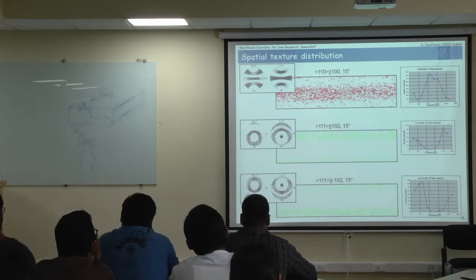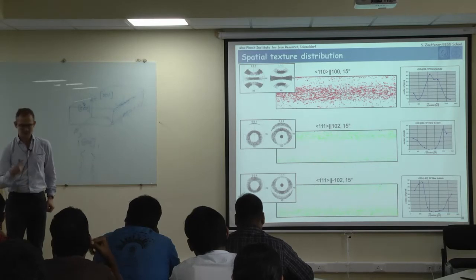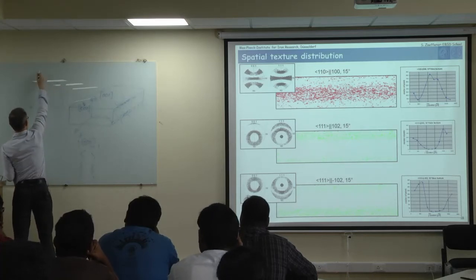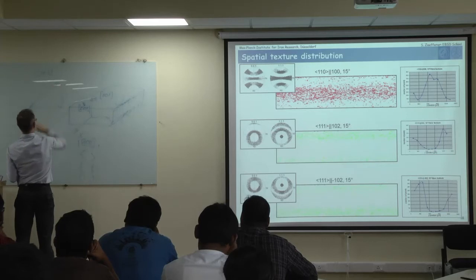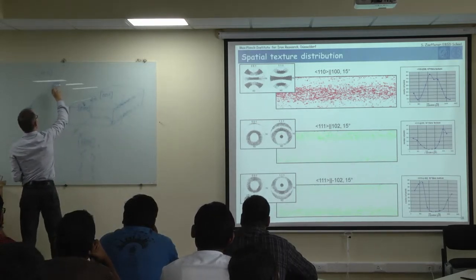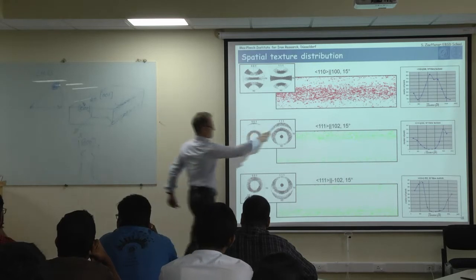So that's why it is actually not only an academic exercise to show that you could look also in any kind of direction for this material. You could select any kind of inverse pole figure, and once again you would have your triangle, and you would not write 001 but you would write 102 on it. And you would get then your intensity distribution. If you plot the 102 sample direction, there is obviously a concentration at this corner here. And that is then this here.